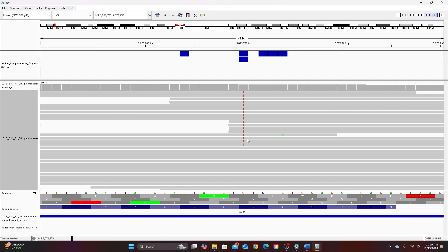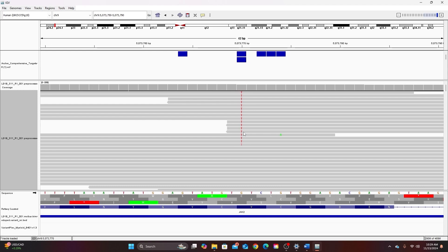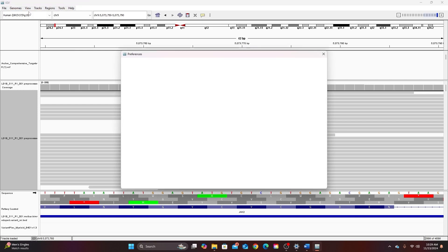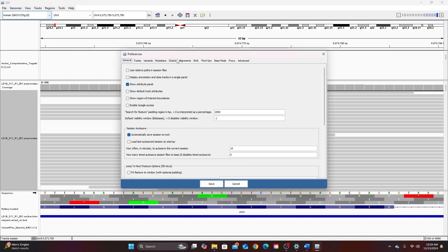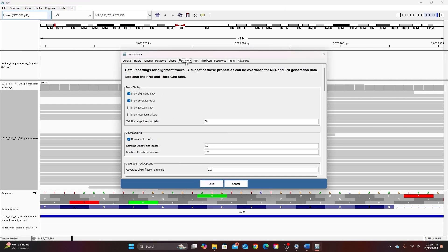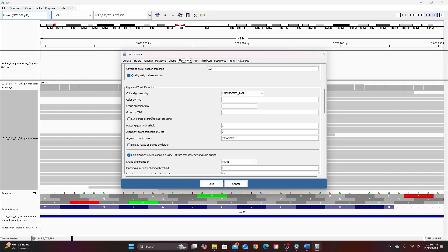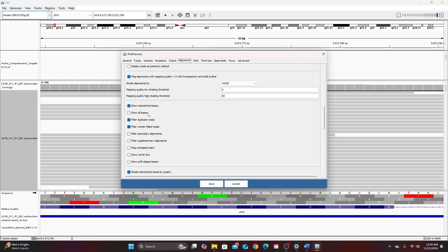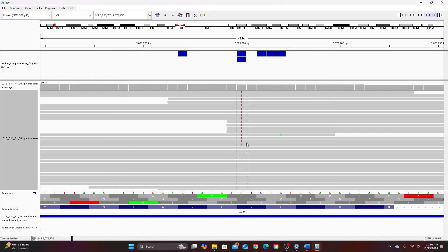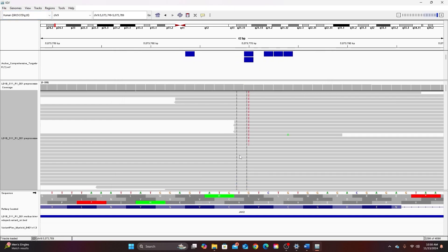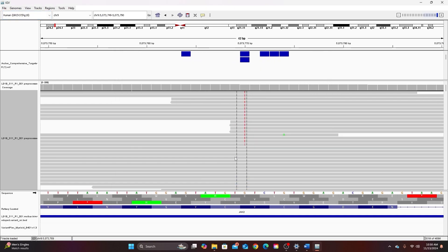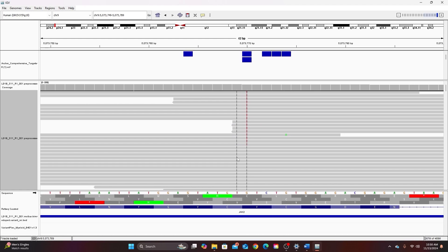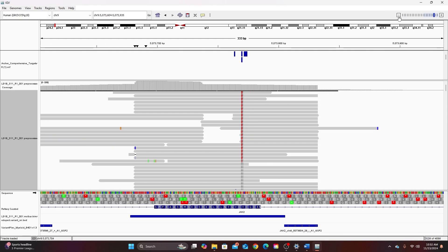When you sort by base you have to make sure that the base that you're sorting by is centered in the window. It can make it a lot easier to tell if the base you're interested in is centered if you produce a centerline. So to do that you would go to view and preferences and here you can find a number of alignment preferences. So I can just scroll down here to find the option to show the centerline and select that and then click save. Now my centerline is produced and I can see whether the bases I'm attempting to sort by are centered or not.